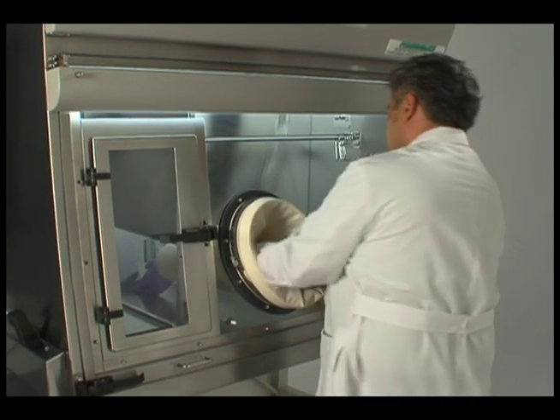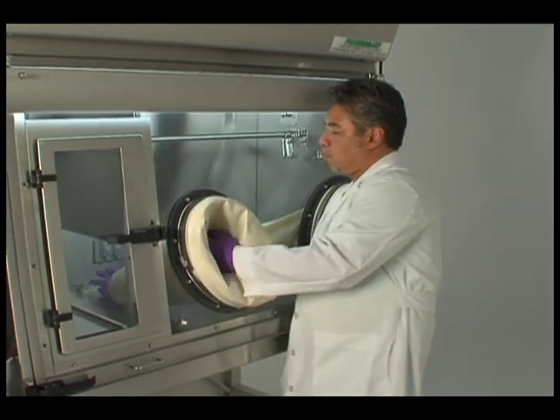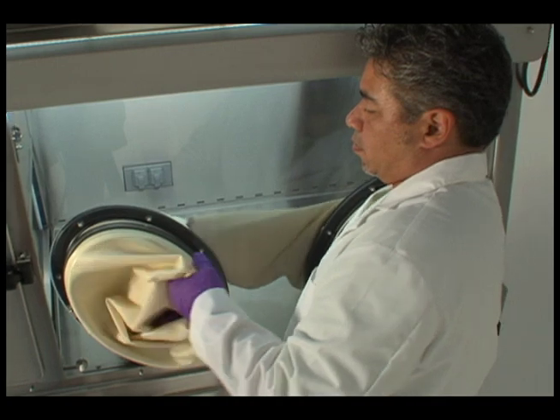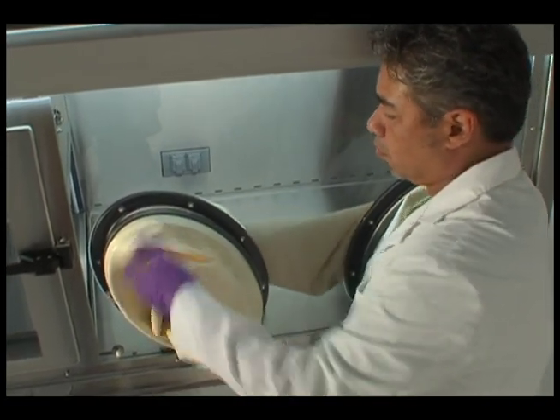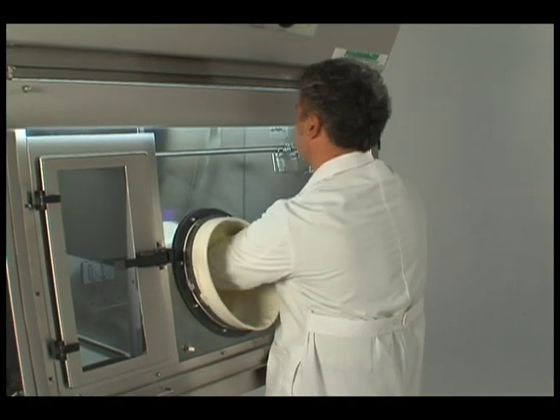Reach through the new sleeve to pull the old one off into the isolator. Dispose of the old sleeve as trace chemohazardous waste.